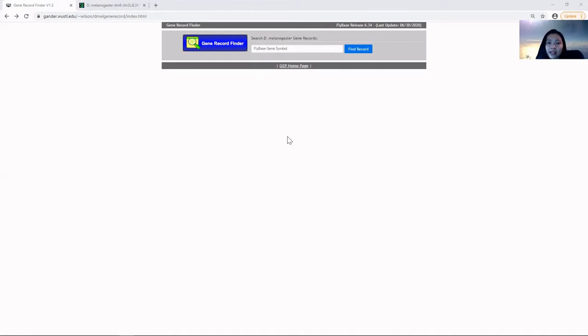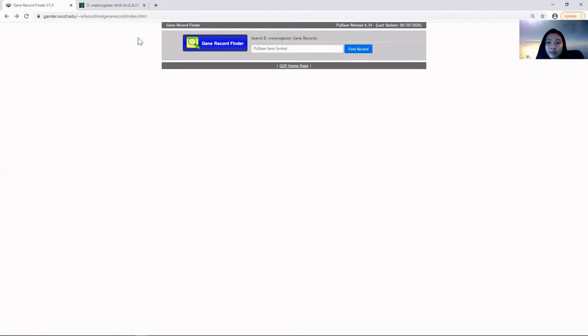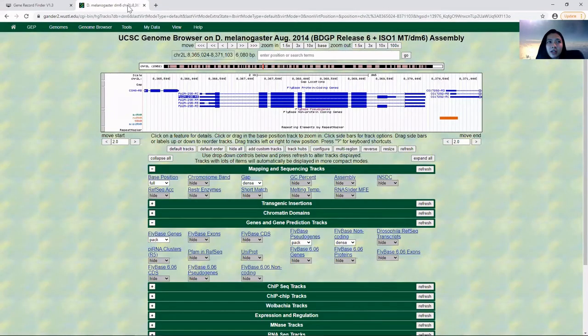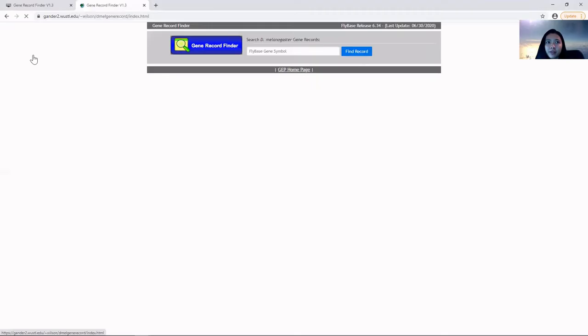You can access this tool from the web link shown here, or you can simply access it via the genome browser page under the GEP tab, where you'll find gene record finder.